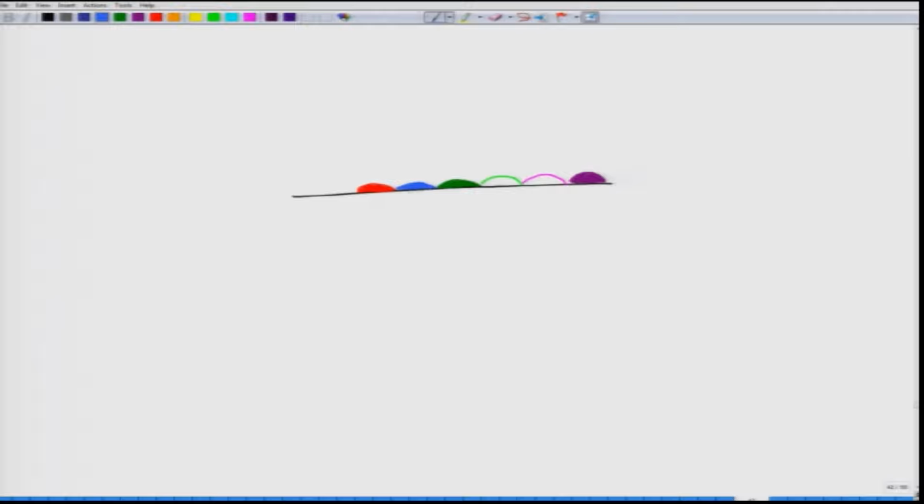Essentially, you have 6 different colors, or 6 different atoms or elements, present on the substrate. Now, let us give them some names. Say this blue stands for silicon, dark green stands for carbon, red stands for say nitrogen, light green stands for lithium, just for your understanding. A lighter pink may stand for hydrogen, and this one stands for oxygen.